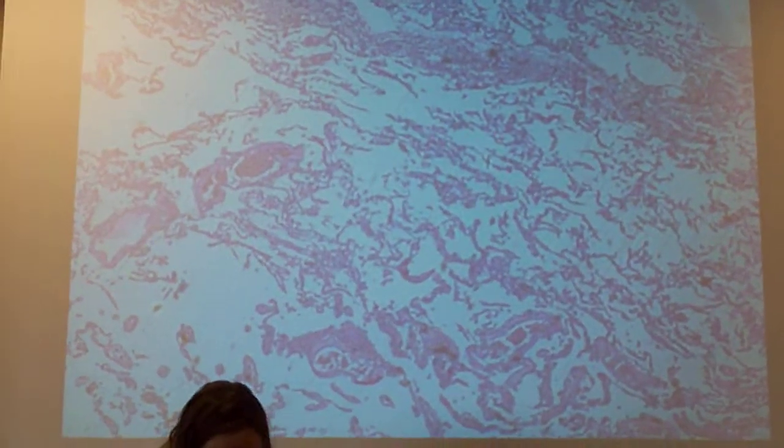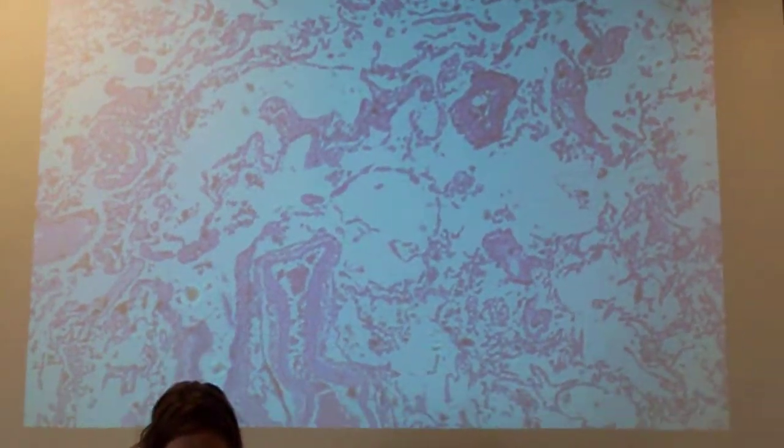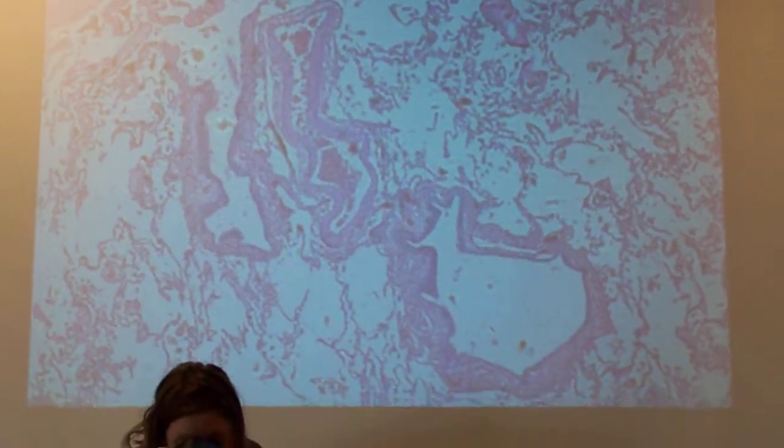What we're looking for when we section out a lung is some of the other tubes bringing air into and out of the lungs, like these guys.